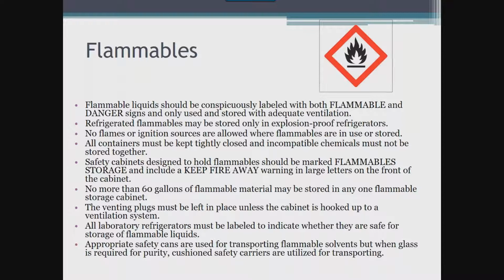Flammables have restrictions in terms of how many gallons can be stored in a particular area outside of fire-resistant cabinets. There are additional restrictions based on the presence or absence of a fire suppression system. It is important to note what your lab allows based on the setup. Regardless of how you store your flammable liquids, you need to make sure that you understand how much flammable liquid storage is allowed in your laboratory based on its size. Flammable cabinets have a maximum storage of 60 gallons per cabinet, but there is a limit to the number of cabinets you can have in any given space.